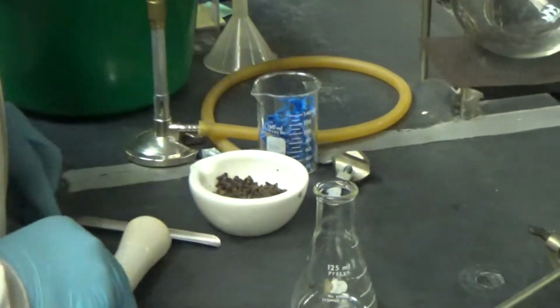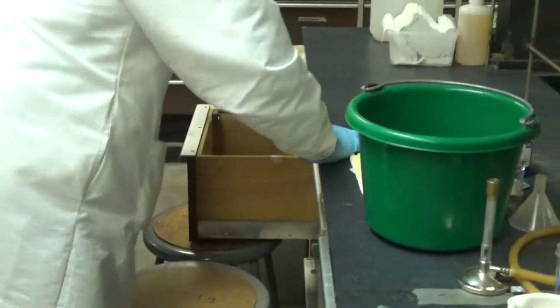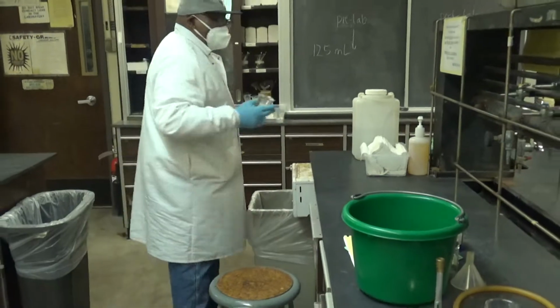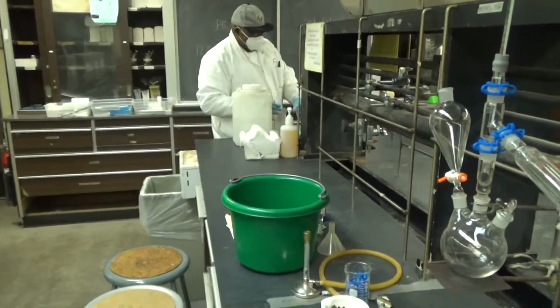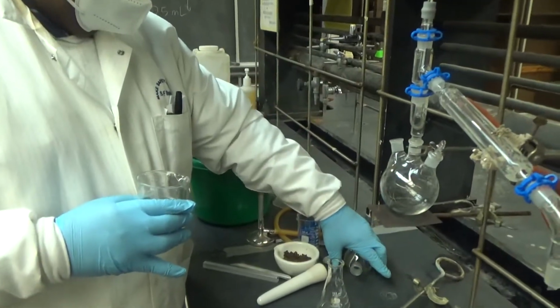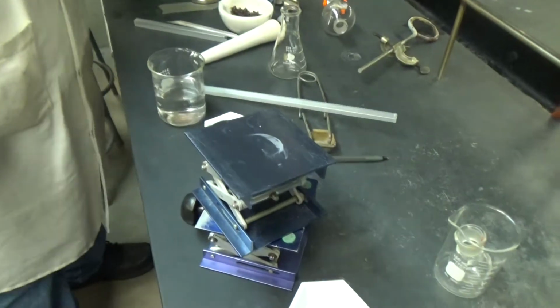So we're going to need 150 milliliters of water. You're going to get 250 milliliters of water? No, 150 milliliters of water. Alright, so you have 150 milliliters of water in a beaker.